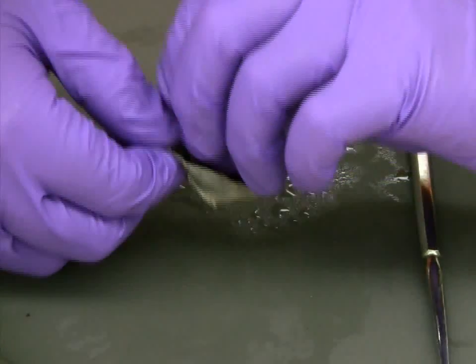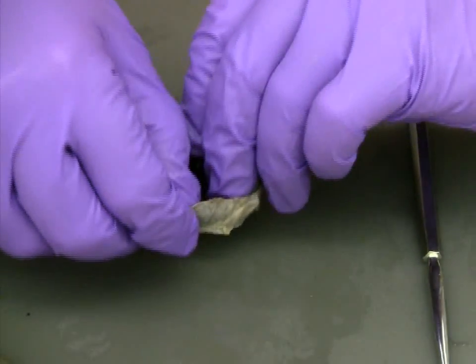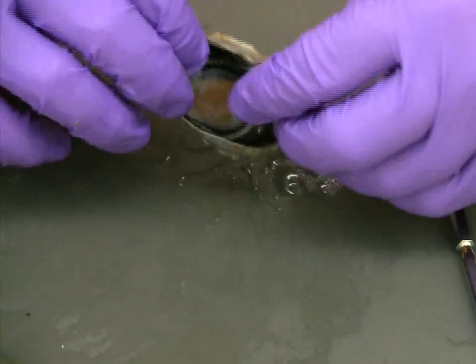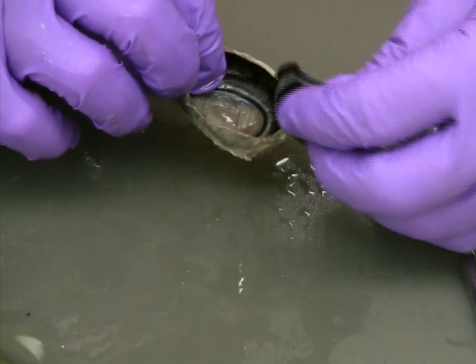Once the lifted portion is large enough, you can use your fingers to slowly remove the rest of the iris. If done carefully, the iris can be removed completely intact.